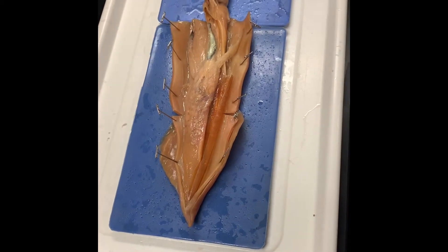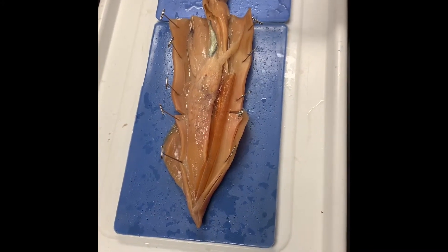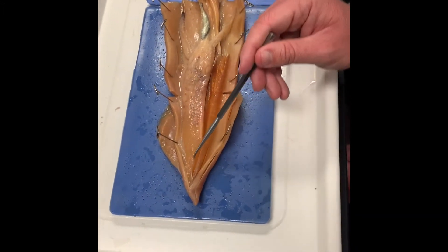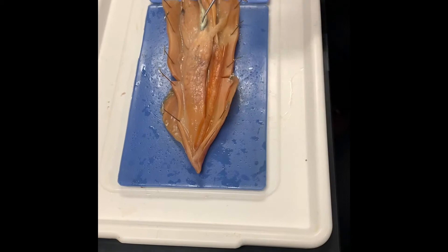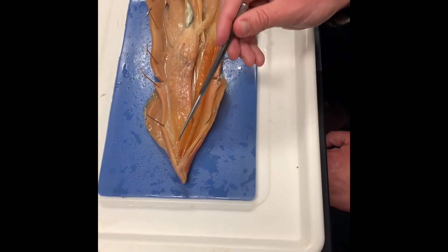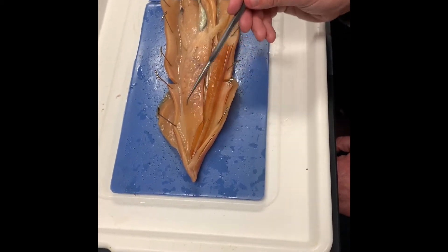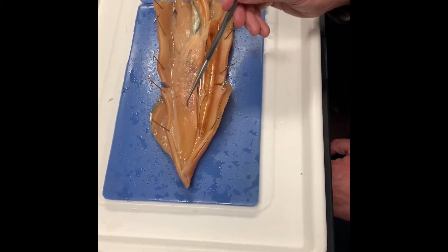Now for the internal stuff. The gonads are first. Filling in all of the dorsal part of the squid — this is all gonad. A lot of the ones we dissected you could tell were female because there were very obviously eggs. This one I don't see obvious eggs, but that doesn't make it automatically male — it could be an undeveloped female. So we're not asking you to identify ovaries or testes, just know it as gonad. It fills this entire upper triangle of the mantle. That's all gonad.